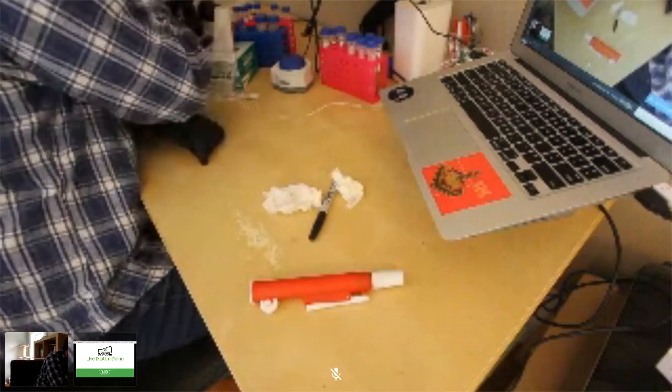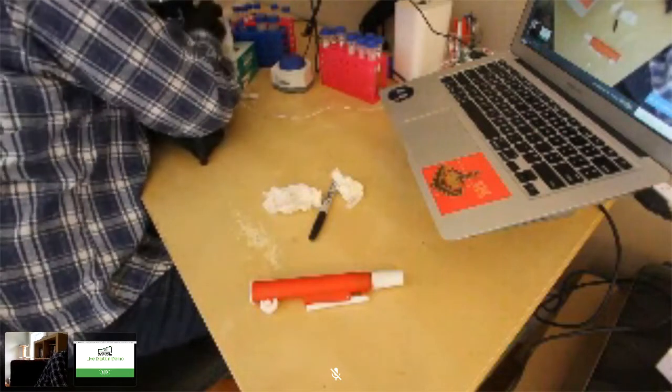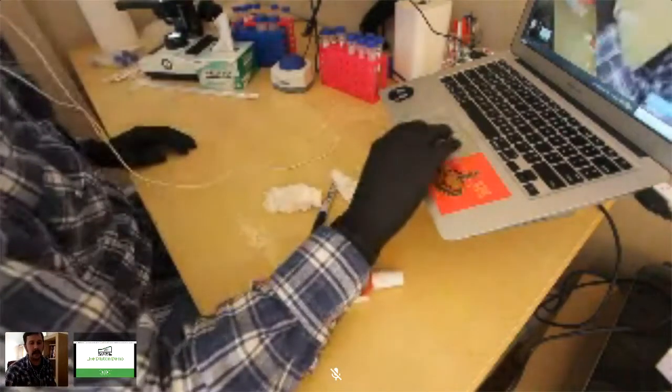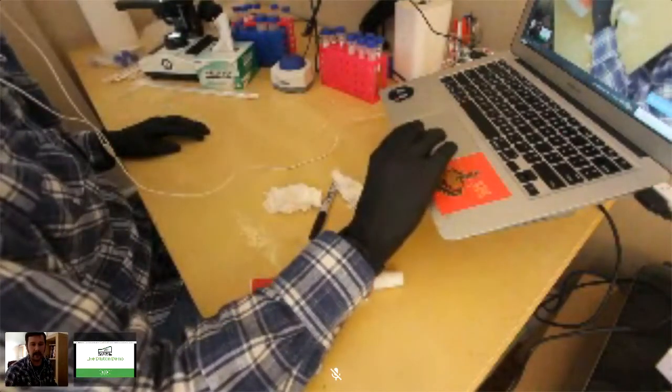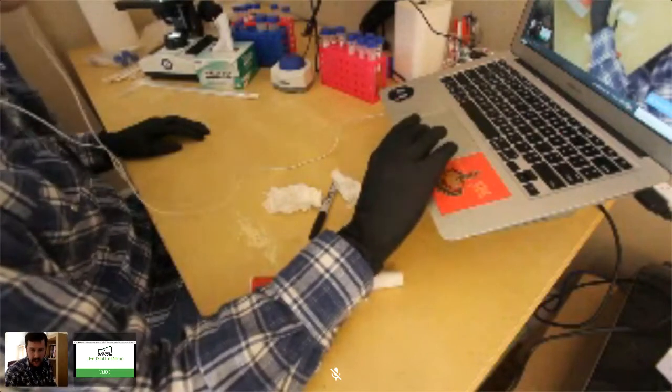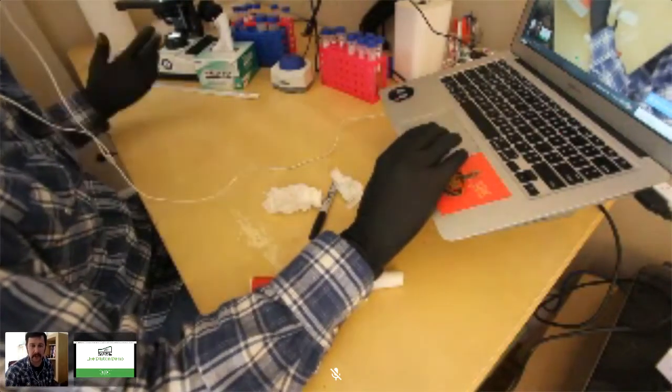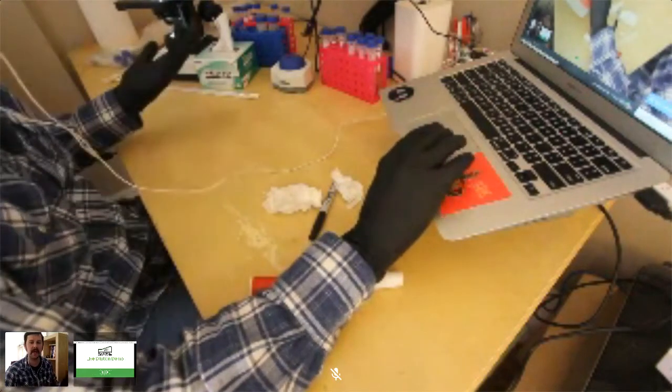So I'm just going to find... We're not going to look at everything. Okay. Now again, I need to swap my camera so we can actually look at it underneath the microscope, and now we're going to be able to see live and dead yeast.